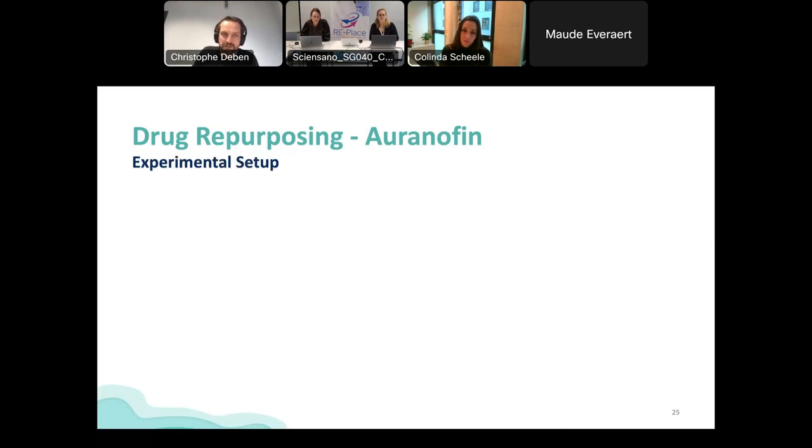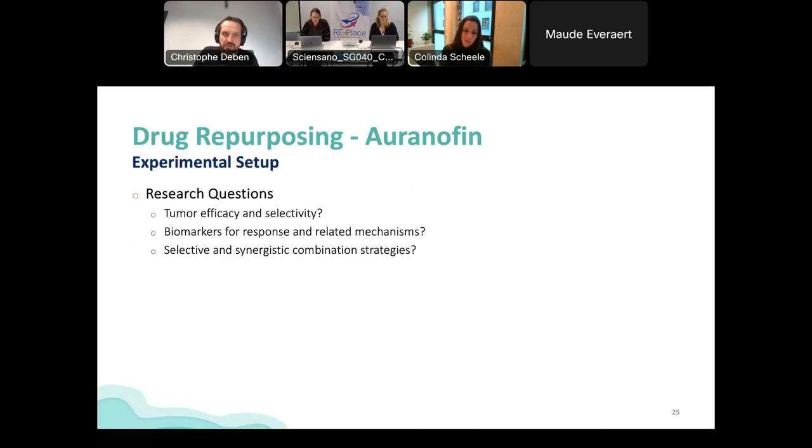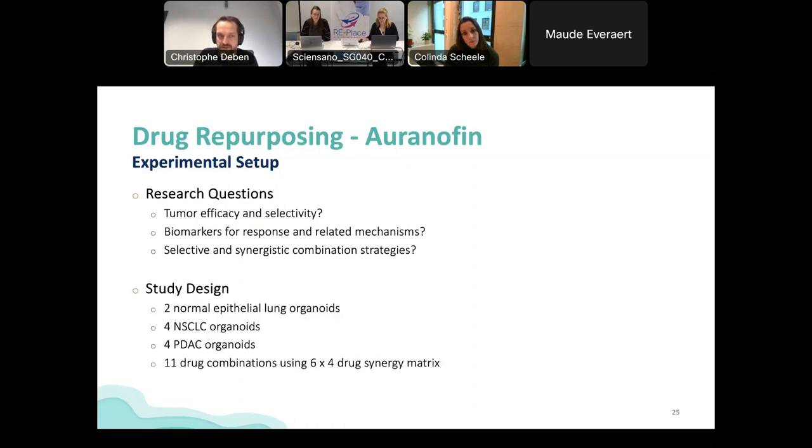And in this study, we wanted to resolve some questions. Is there tumor efficacy of auranofin, and is it selective towards cancer epithelial cells? We used healthy lung organoids in comparison. We wanted to define biomarkers for response, which is of course always very useful so that you can stratify patients in the future. And then we wanted to identify selective and synergistic combination strategies.